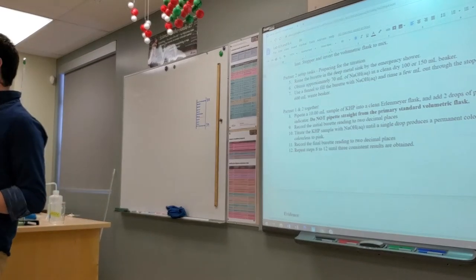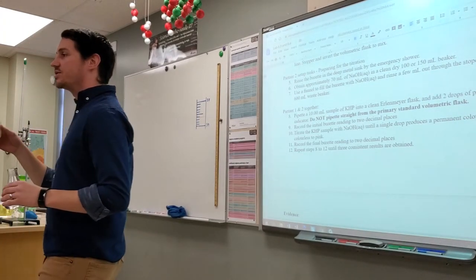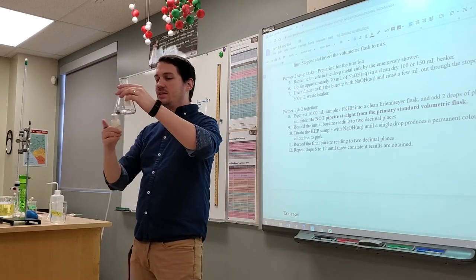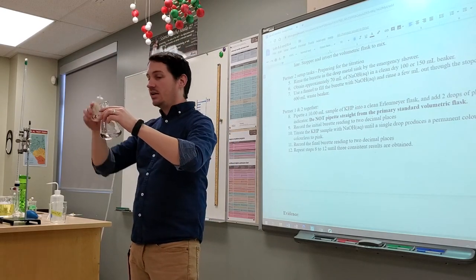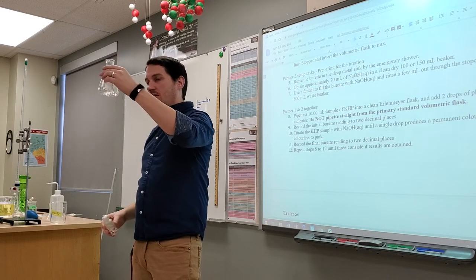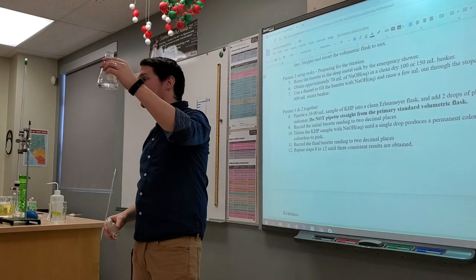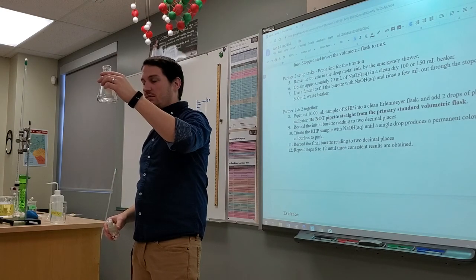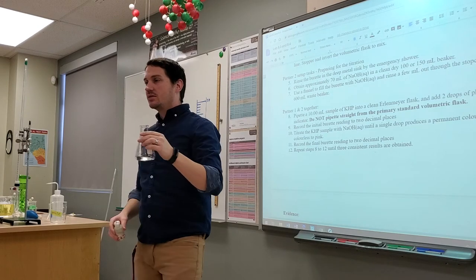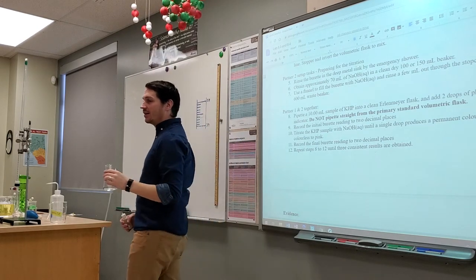Okay, we're going to use a chemical indicator for this, right? Because indicators change based on acid-base interactions. So I'm going to add phenolphthalein to this. KHP is an acid, so it should stay colorless. Do you know what's going to happen when I add a base to this? It's going to turn pink.